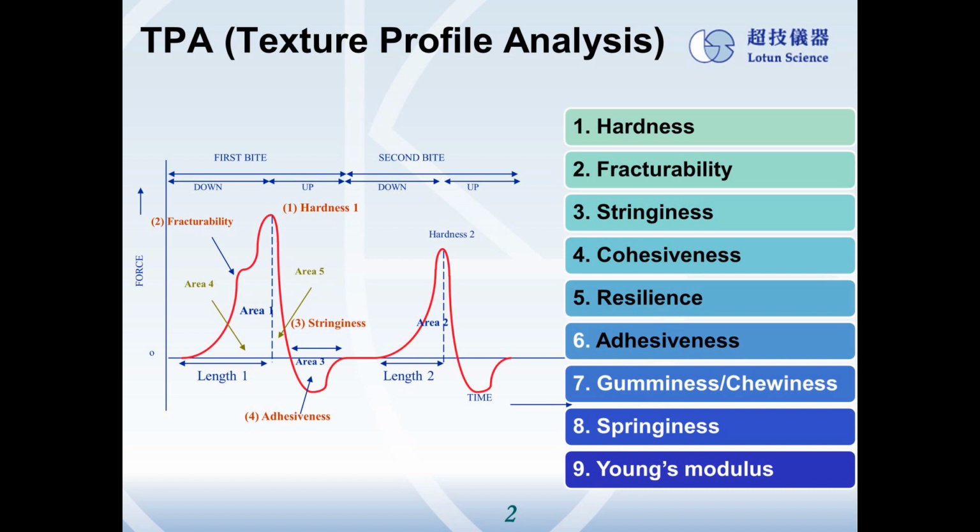However, for the extent of tastiness, a destructive analysis should be involved to understand the internal textural characteristics of foods. Therefore, it is important that we assess the springiness of foods by non-destructive deformation tests, while getting information regarding the sense or oral taste by using the same set of analyses.